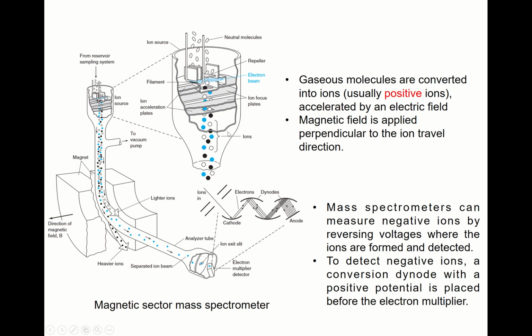And then these ions are moving down, okay, and then when they enter this magnet, you see, the charged particles' path becomes changed, right, in the magnet, okay.